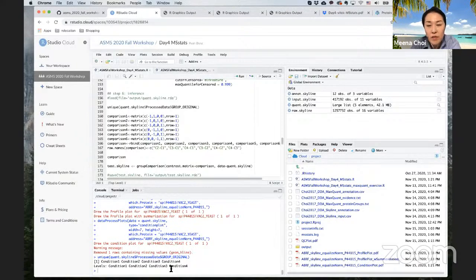However, sometimes if we say healthy, disease, MSstats or R just defines this order alphabetically. So disease is probably first and healthy second. But if you think healthy is first and disease second, this order really matters for how you define the comparison.